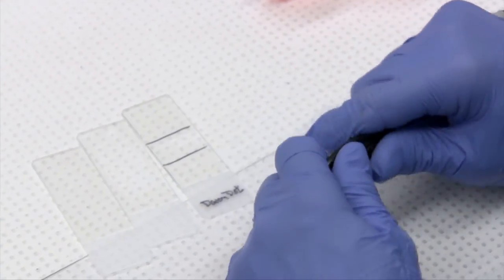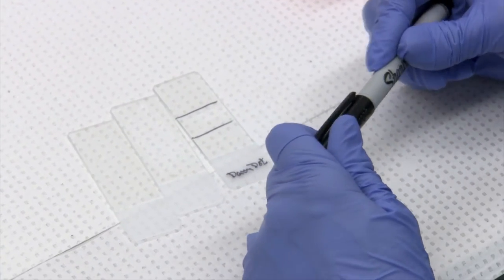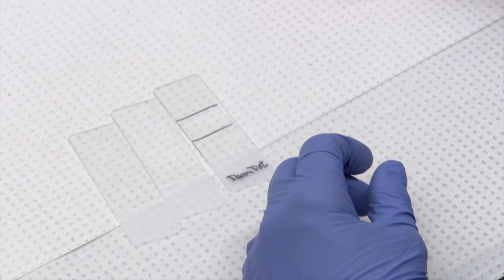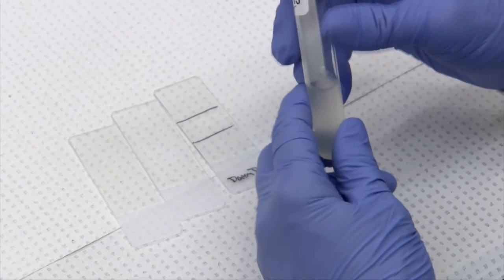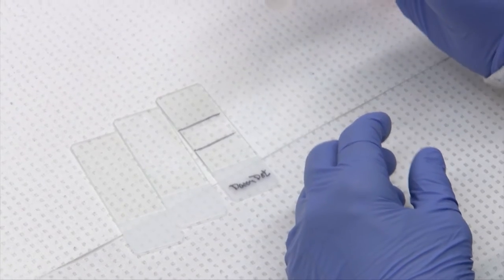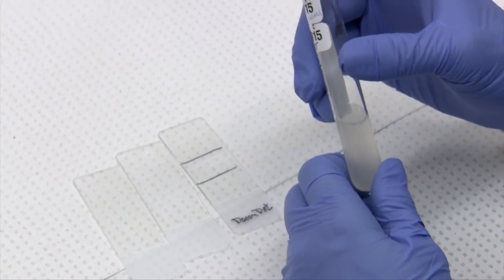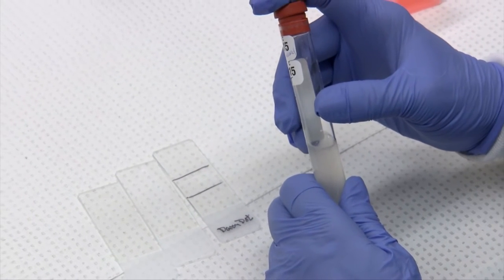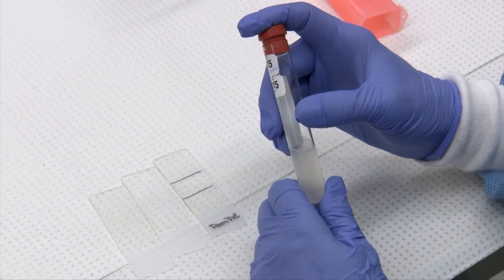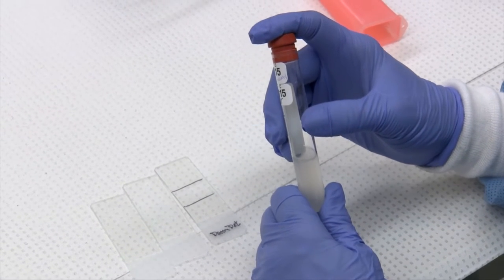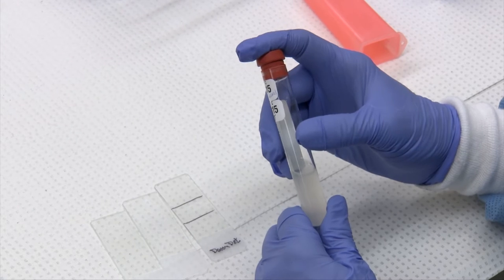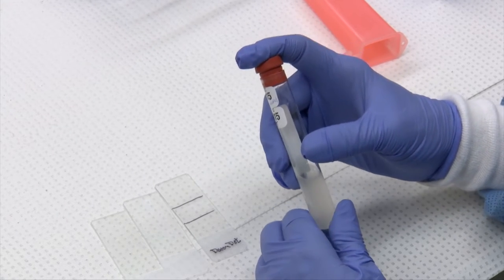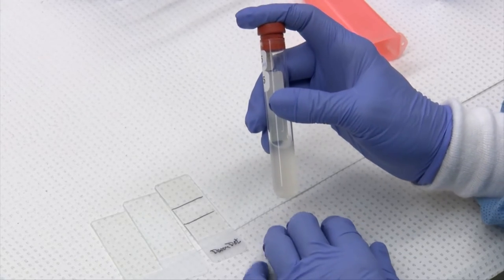Now bearing in mind that most clinics are not going to have a cytospin but you still might want to view a concentrated sample. What you can do is just treat your fluid like a urine. So you could pour off an aliquot, spin it down in your regular centrifuge, take off the supernatant, and make a smear of the sediment with a pipette. And all you need to do is indicate on that slide that it's a concentrated preparation, again if you are sending it to a reference lab.